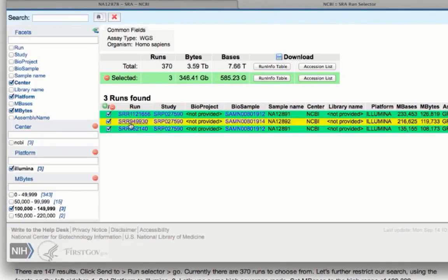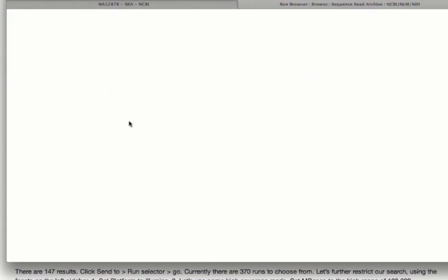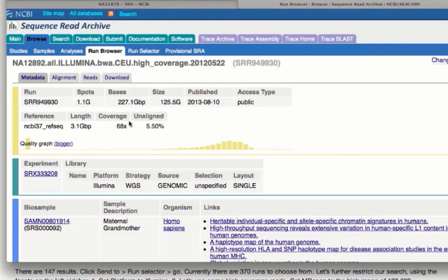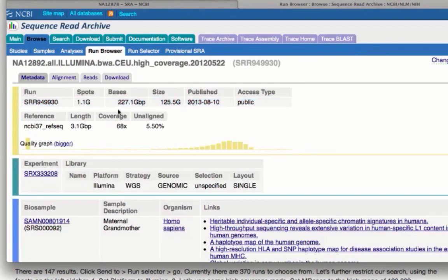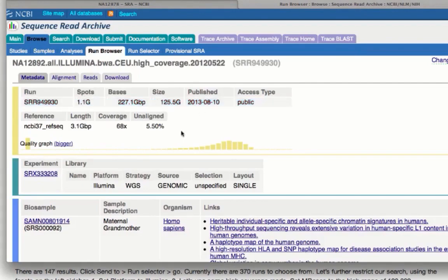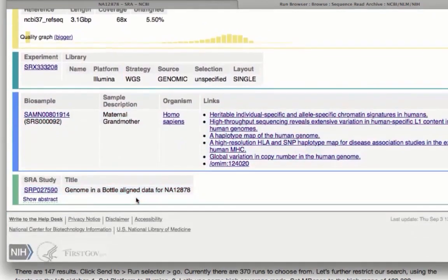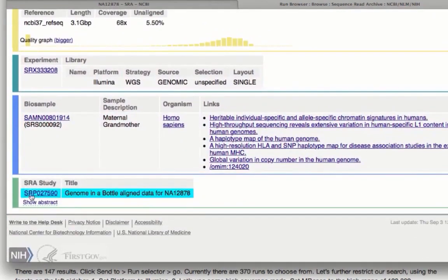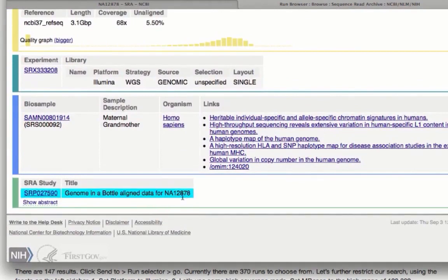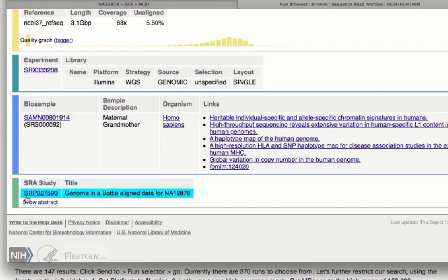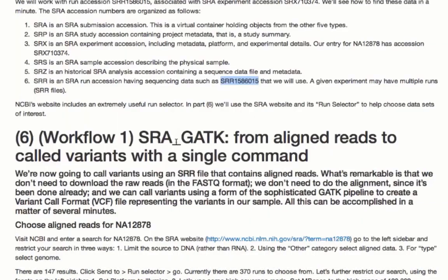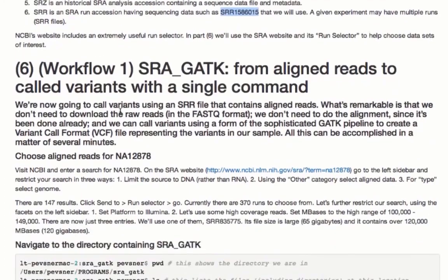Then to the run selector, if you want to, you can click on these and look further at what that run accession looks like as it's hyperlinked. And it shows you the sequence read archive, this particular entry with information about how many bases were sequenced, the size of the file, the date, and links to much further information, including the study number. And this is part of Genome in a Bottle, which is the project to deeply characterize NA12878 and some related genomes. So getting that is really easy. And with that, we're ready for our main workflow.